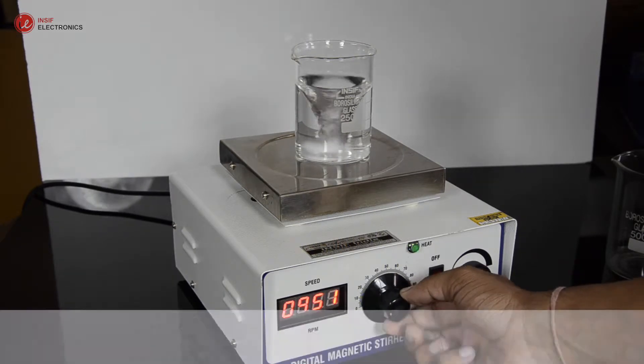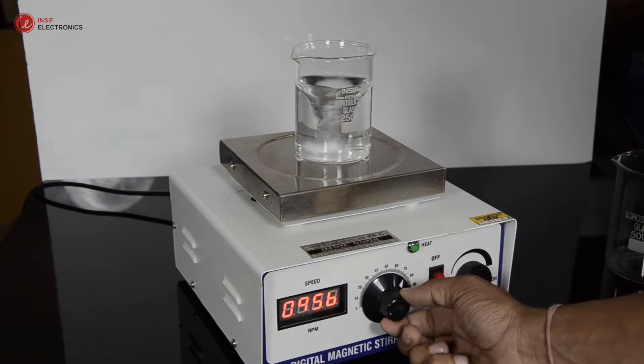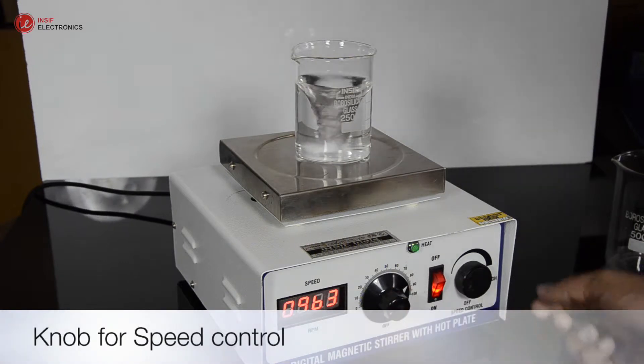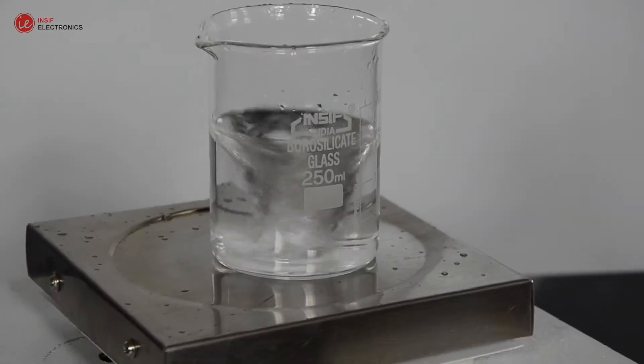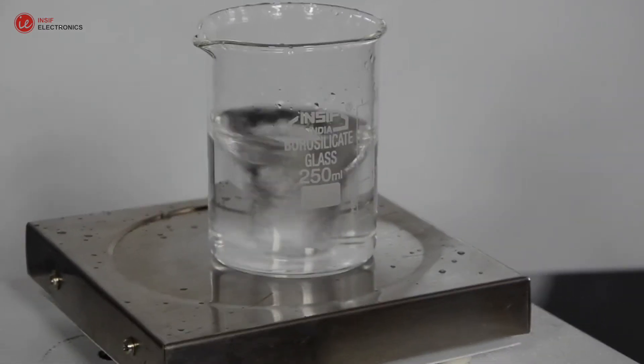It has LED display to show the speed of stirring, which can be controlled by rotating the knob. Similarly, we can easily adjust the temperature of the hot plate by rotating the knob of thermostat.